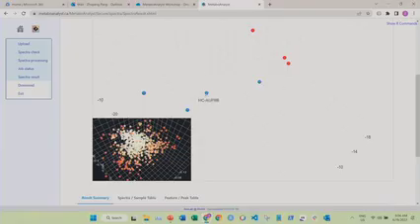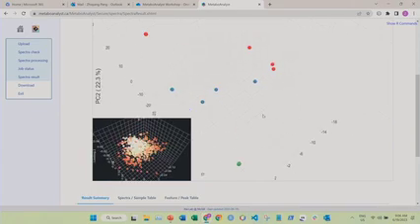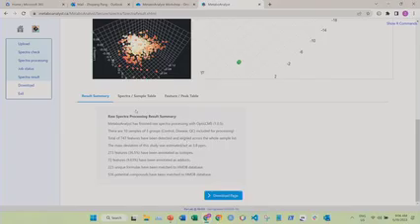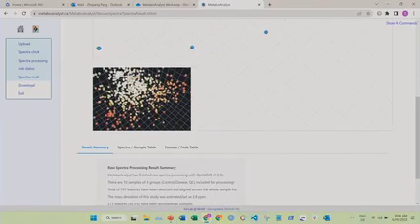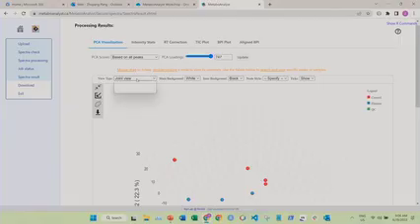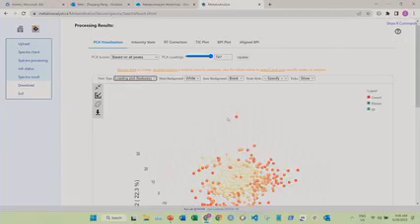So for example, this one. Yeah, I need to use my mouse because of my computer issue. So you can switch that one. So you can loading switch. Yeah. So we can use the loading plots, and we can see the different features also here.